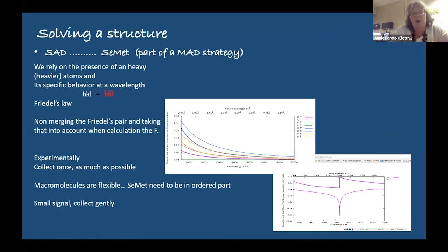So the tendency of crystallographers is to always want higher resolution. You always want to push it a tiny bit, give it a tiny bit more exposure time, and your crystal will decay. And normally the decay occurs at exactly the interesting residue that you're looking at. So collecting very gently a moderate resolution map as a starting point, and once you have this starting point, you can move on with your next crystals and really lean on them and get the high resolution that you want.